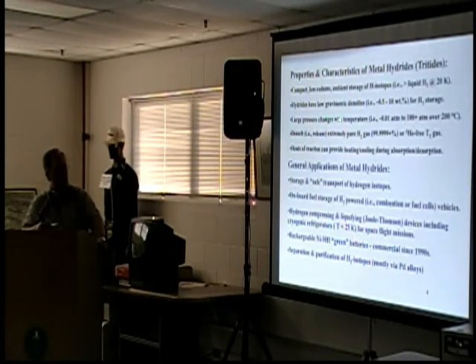You get these large pressure changes with temperature. I showed you on the last one, you can go from a 100th of an atmosphere to over 100 atmospheres in 200 degrees change in temperature. So this can be used for pressurizing systems or for collecting gas.